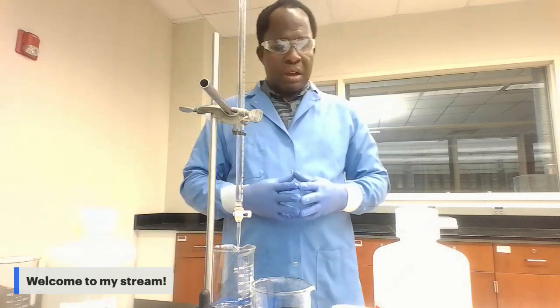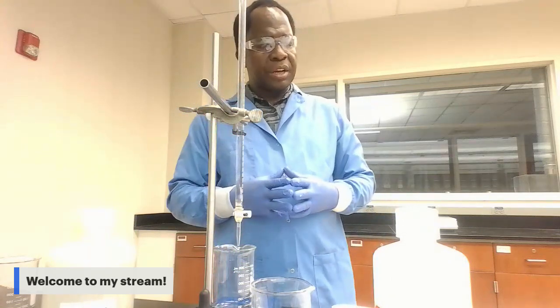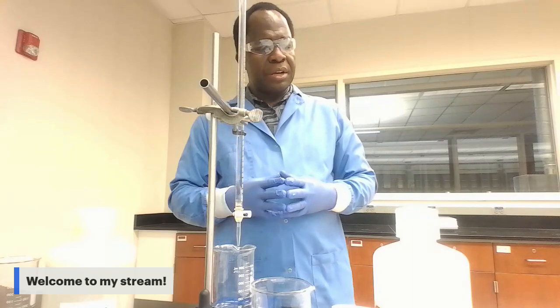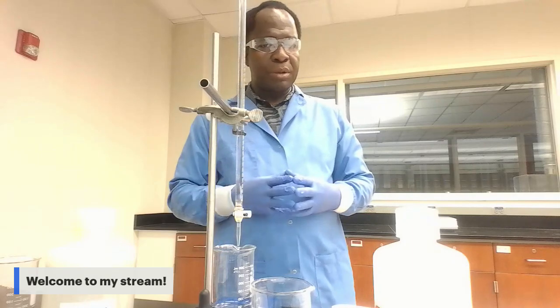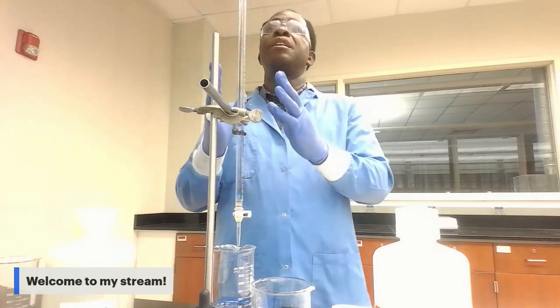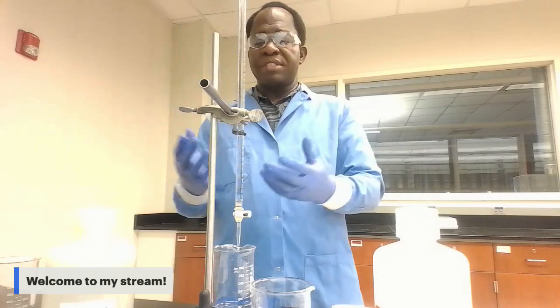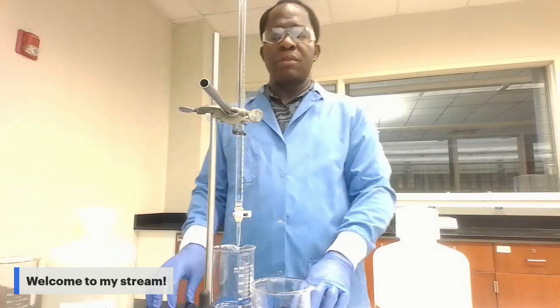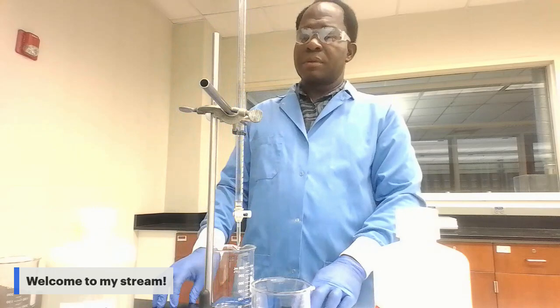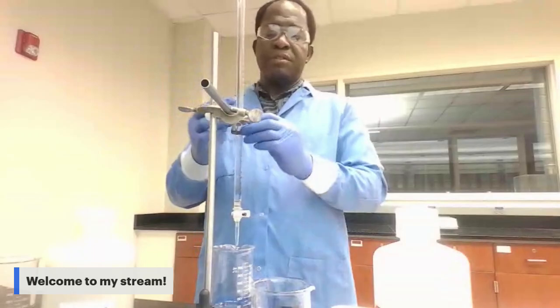Now let's proceed to part one of the procedure of this experiment. As you can see, I already have my setup here. You need to have the same setup at your desk when you come to the lab. You have the burette, the stand, and the clamp. Make sure you have all those in place before you start the lab.